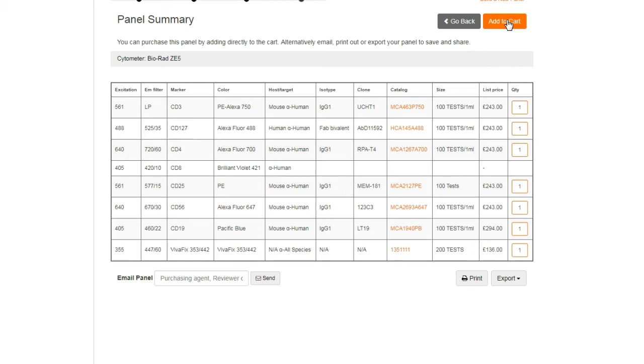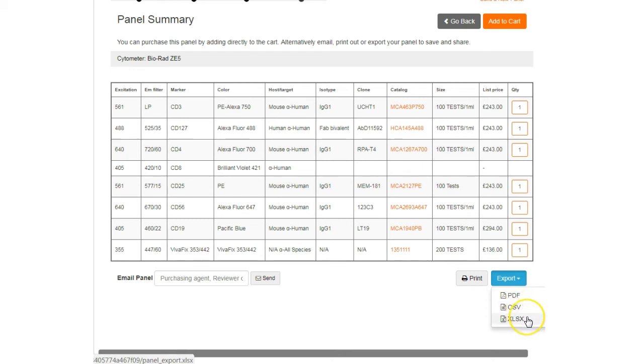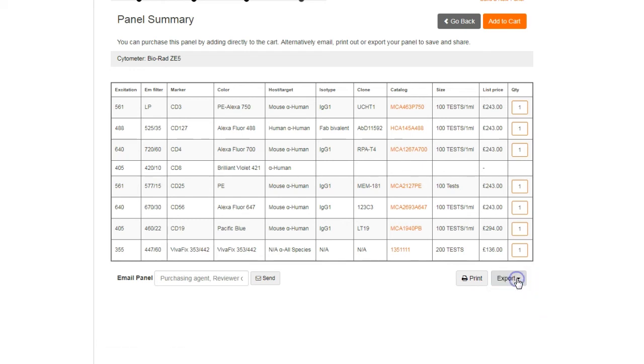To store the selection for later use, you can export the results in a variety of useful formats or email it to save and to share.